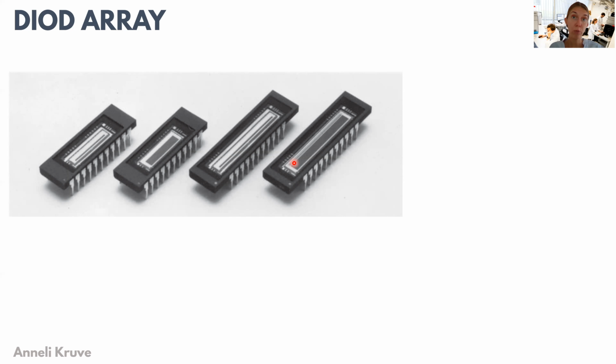This is very useful to measure the whole spectrum at once, and it is very often used in cases where ultraviolet visible spectroscopy is coupled with chromatography. This is especially important here because in chromatography you have to collect the spectrum as fast as possible because of the constant separation of the compounds.